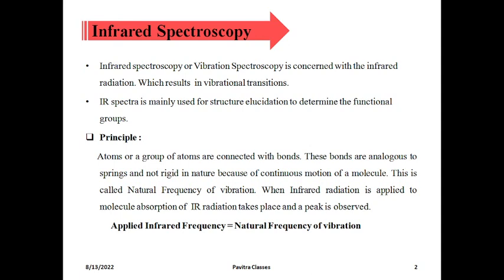So what is the principle behind the IR? Atoms or groups of atoms are connected with bonds. As we know in organic chemistry, all the atoms are connected by bonds in the molecule. The bonds are analogous to springs and are not rigid by nature. If a methane molecule is there, the bond between the carbon and the hydrogen is not rigid. It has some vibrations.